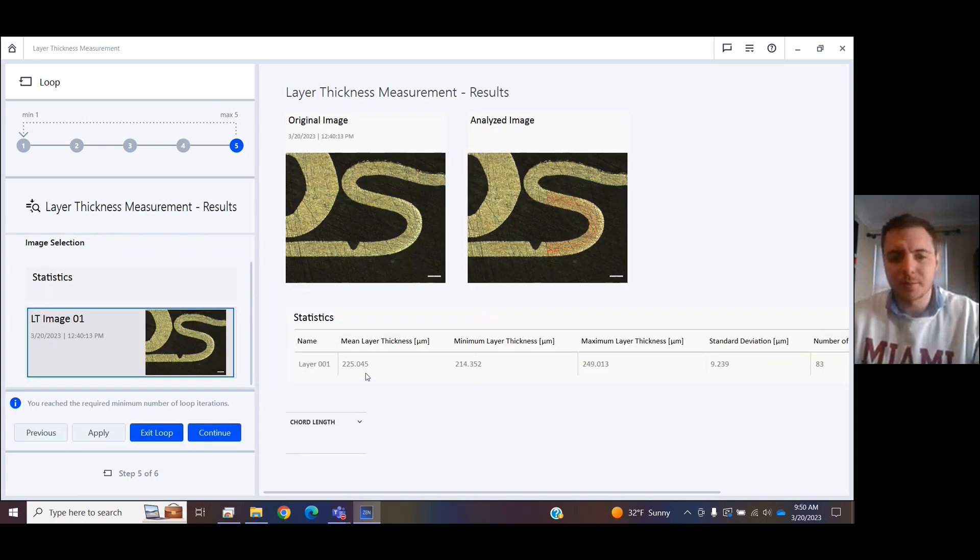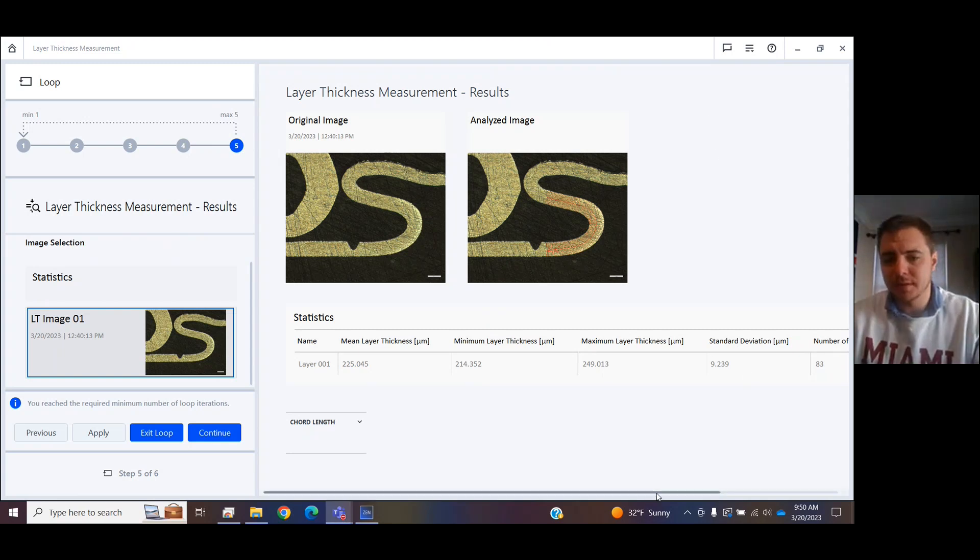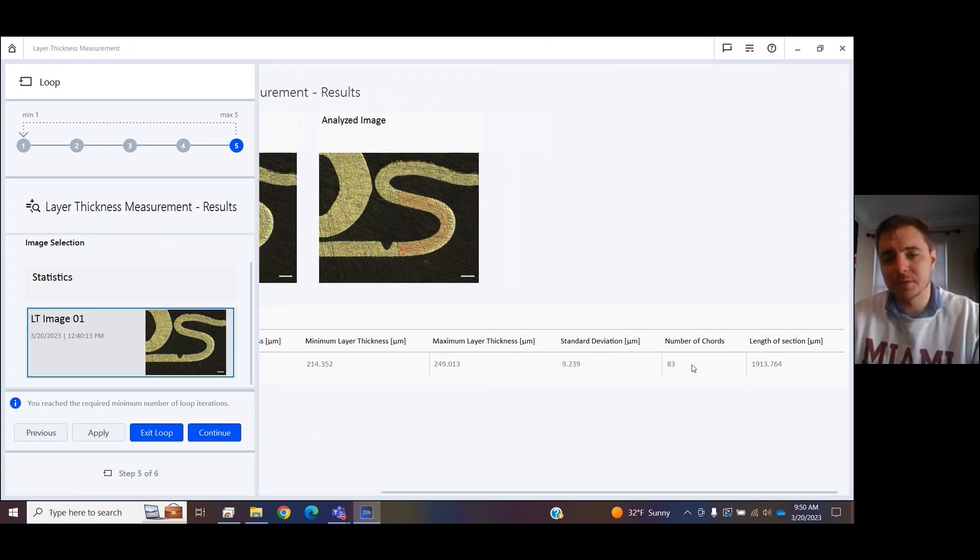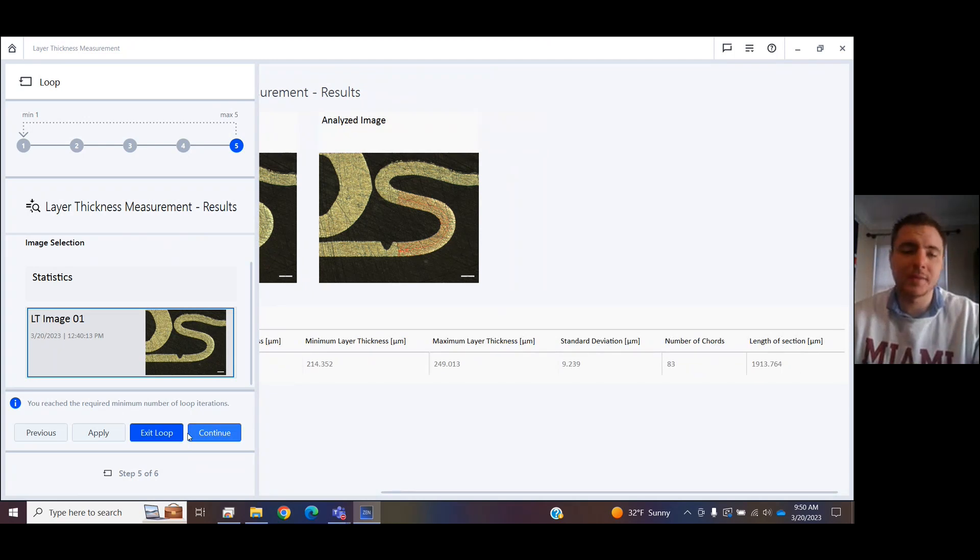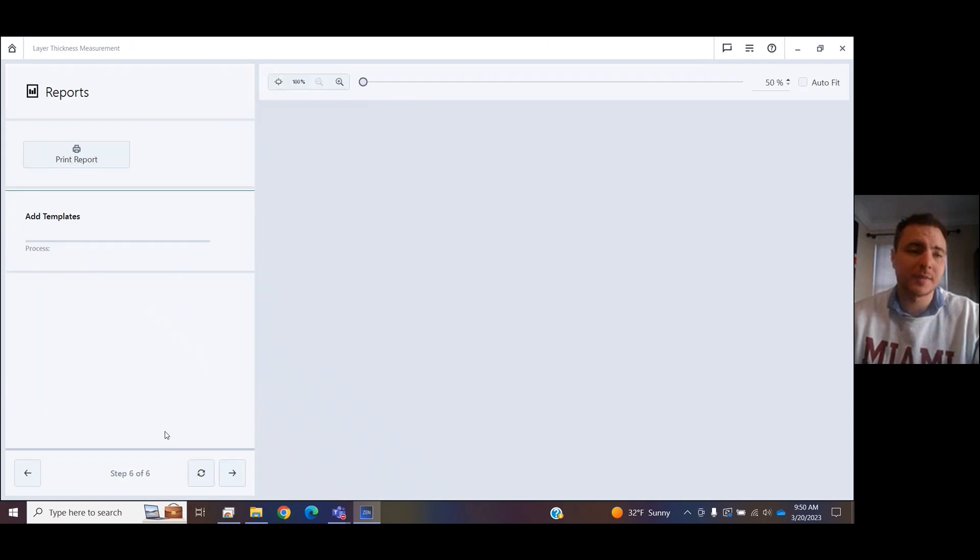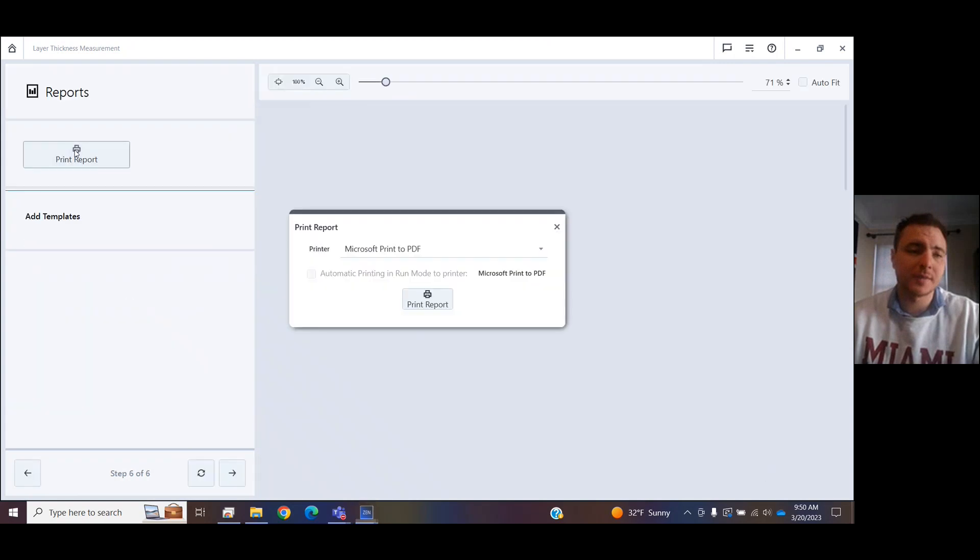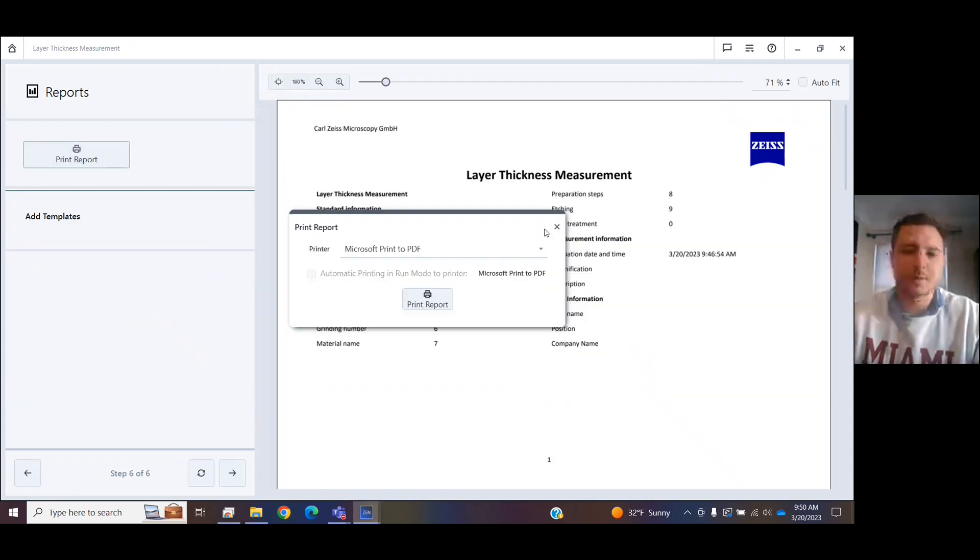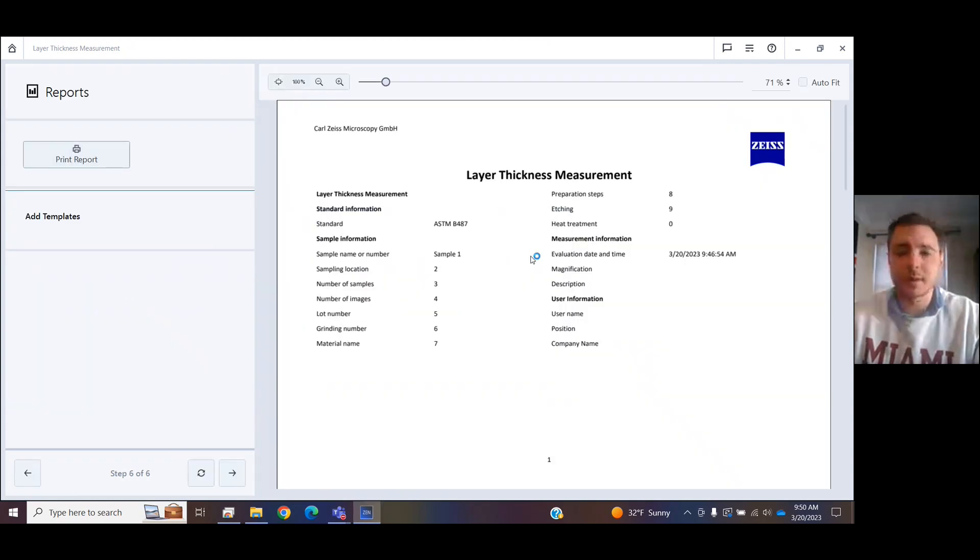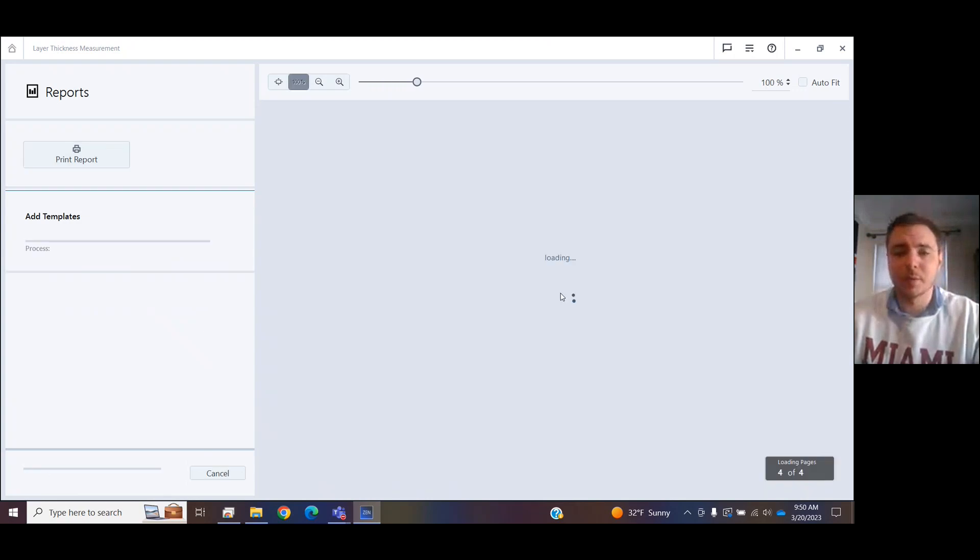It will tell me the mean layer thickness, the minimum and the maximum across where it measured, the standard deviation, total number of chords it took, the length of the section of the layer. If I press Exit Loop, it's going to give me the opportunity to print this out as a PDF. And look, here's my report.